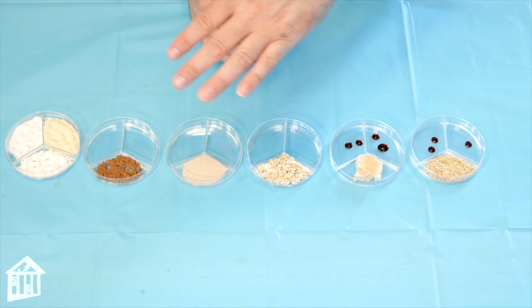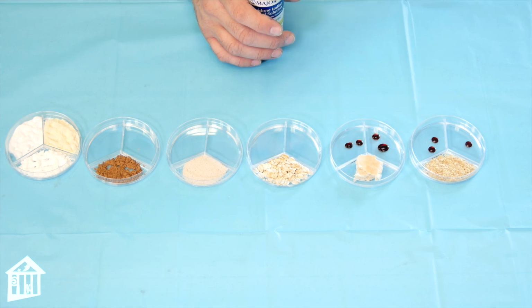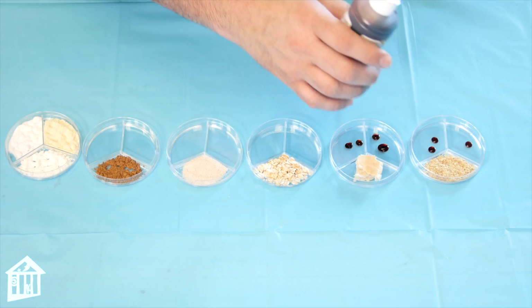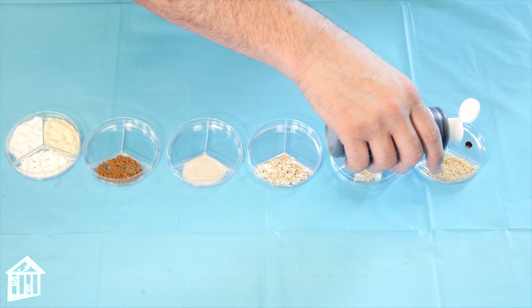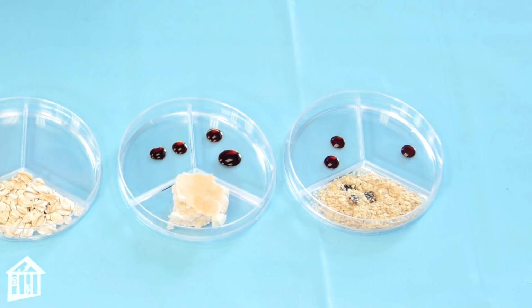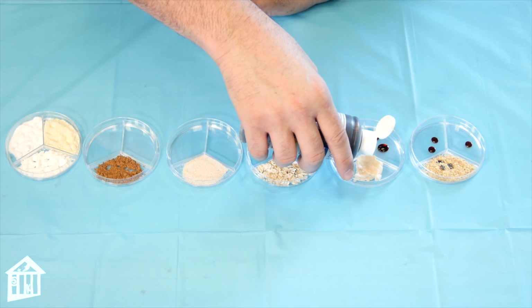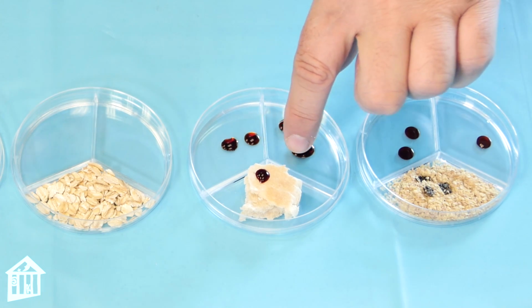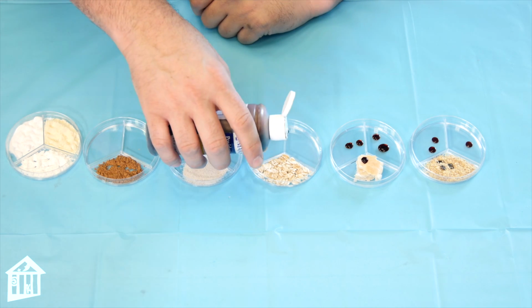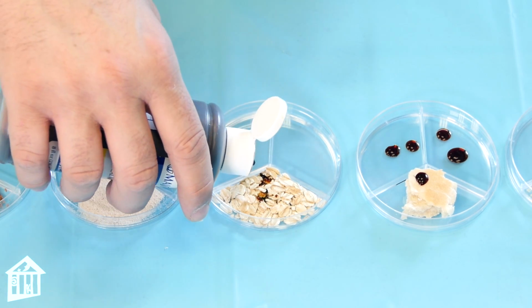When I get something with starch in it, it's gonna turn either a really deep dark blue or look really black. So from that point, all you gotta do is test. So we'll start over here and we'll see what happens. There might be some starch in here because that one turned a little blackish. Let's go ahead and test this one. Nothing. You can see that it's the same color as the drops over here. This one looks a little black. Let's try these oats here. See, nothing really happening to the oats. Probably no starch in those.